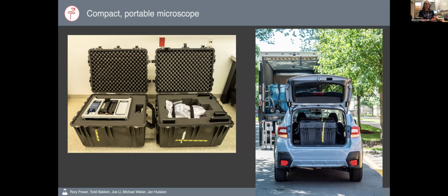Right. Thanks. And there's a quick question. What is the cost of building the microscope, roughly? Yeah, so depending on the cameras and lasers, etc., it can be anywhere between 50 and 120,000 euros or dollars. So yeah, of course, it isn't as fancy as some commercial systems, and of course, that's just the cost of the parts. So compared to commercial systems, obviously that's a lot cheaper.